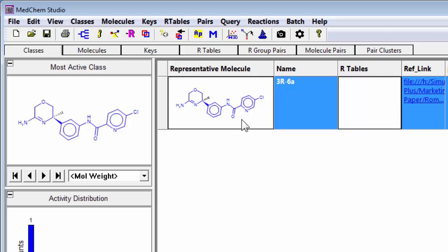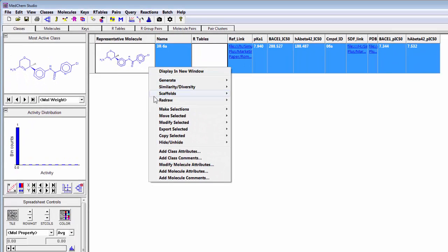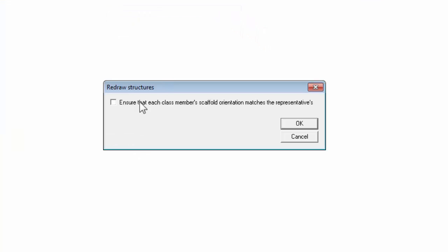You see how it's aligned this. Now I simply do a right mouse button click, redraw, generate new structures, and then ensure each class member's scaffold orientation matches the representative molecule.